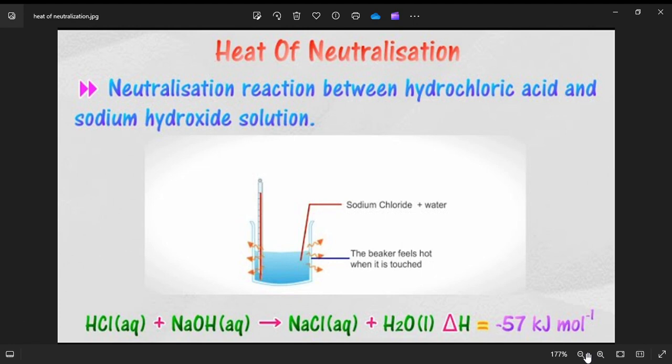That same formula we use for heat of solution is still the same formula we are going to use here. E equals mc theta or Q equals mc theta, where m is the mass, C is the specific heat, and theta is your temperature change. Okay, the procedure is given in the manual.